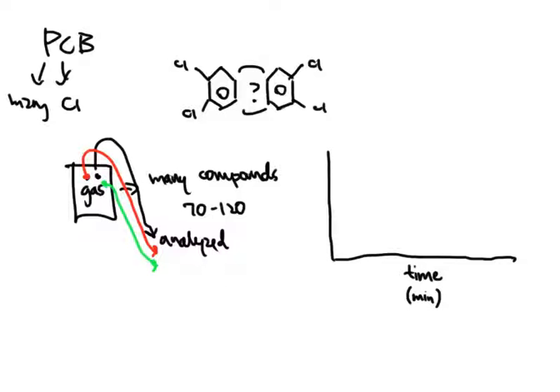So what happens is that the GC will take your mixture, and this mixture will begin to be analyzed. Well, it takes some time for the mixture to go through the machine, and this creates what we call the baseline, or in the beginning, this is just flatlining out at the 0 mark. Okay, and then sooner or later, one of these components will come through the machine and be seen by the instrument itself.